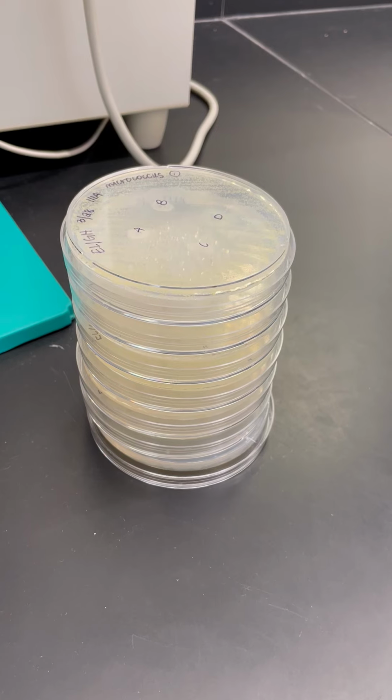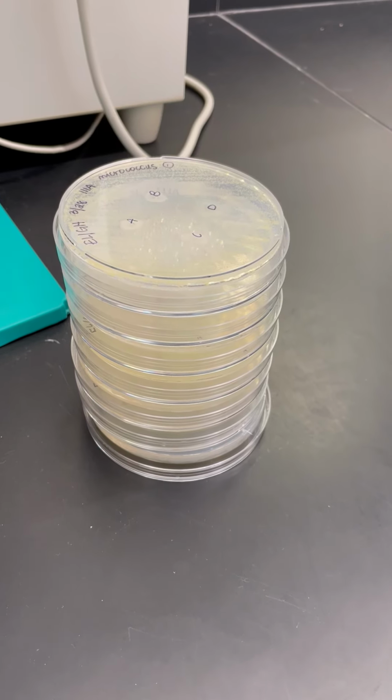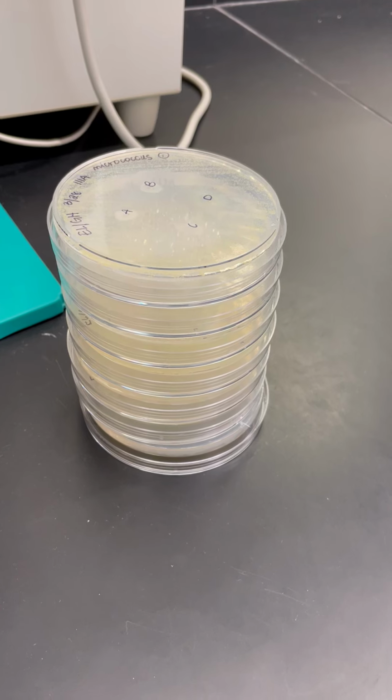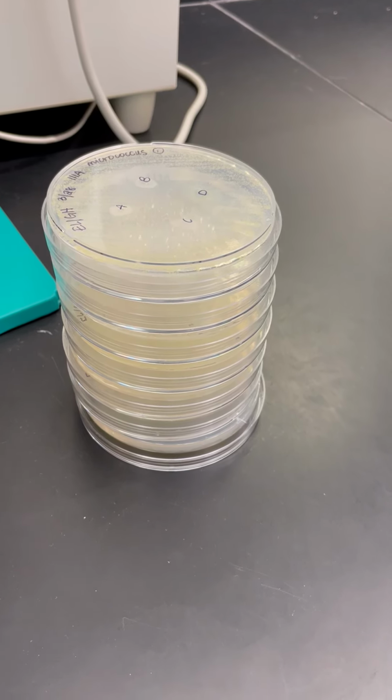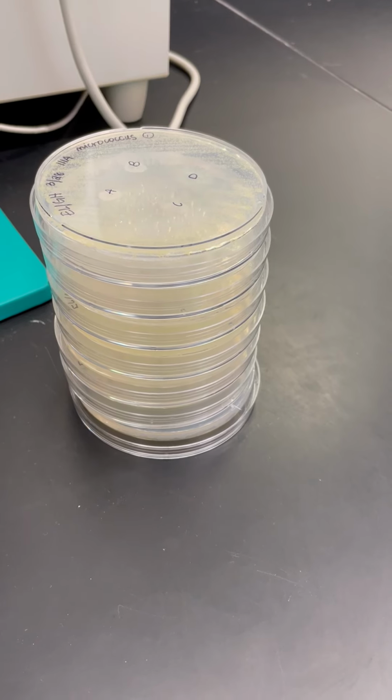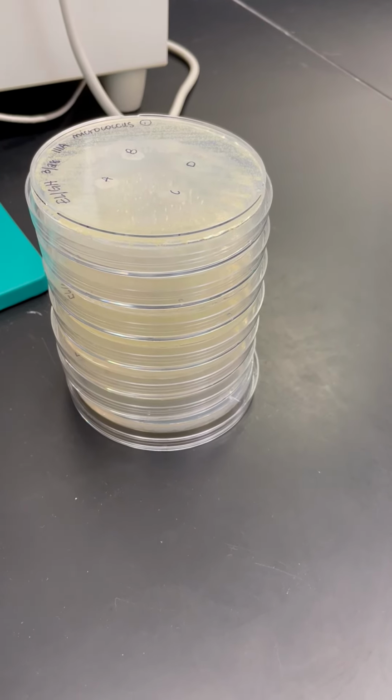Remember, the idea was you had 4 isolates on your master plate. In this particular case, they're called A, B, C, and D. And then you had 7 R2A plates, and on each of them, we put a different bacterium.